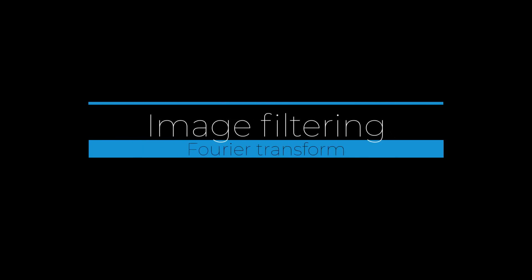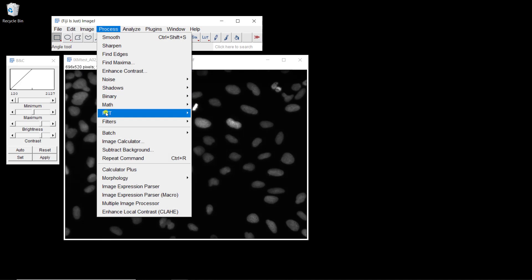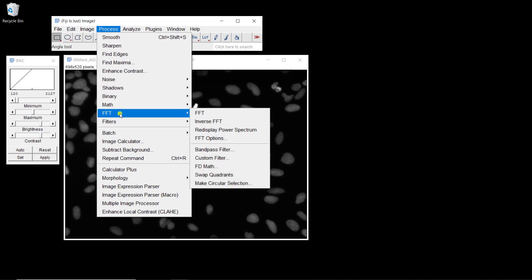In this video, I'm going to show you how you can apply Fourier transform to images with ImageJ and how to apply inverse Fourier transform. We start with the same image we've used in this whole session about nuclei. With ImageJ it's very easy to apply Fourier transform — you just go to Process, FFT, which stands for Fast Fourier Transform, and then FFT.